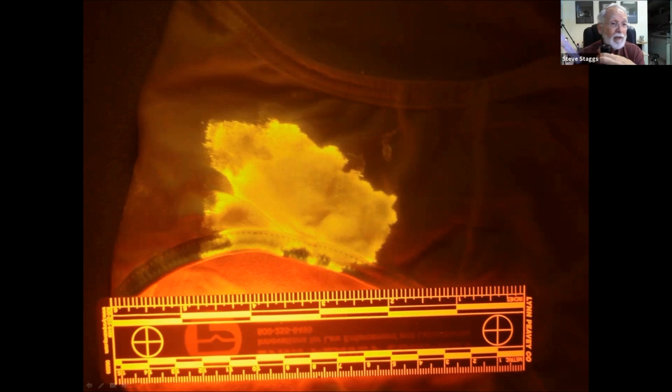Now, to document it, I just do the same thing for the camera. Instead of using electronic flash or ambient light, I'm going to use the alternate light source, the blue light, as my lighting source. And then so that the camera can actually see the result, the fluorescence, I'm going to put an orange filter over the lens of the camera. And in order to be able to have a scale in the photograph, if I need one, I'm going to put the fluorescent scale on the same plane as my evidence. I take the picture. Now, this is when I would definitely be checking my review screen.